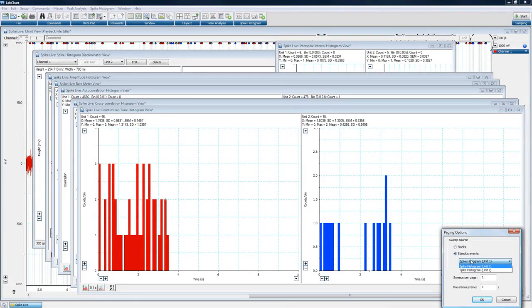So any data you can use in one of those features to define an event in general with peak analysis, any of the modules, with spike histogram as well as cycling measurements, you can use those stimulus events as the triggering information for the peristimulus time histogram. So very useful tool in terms of comparing these unit firings with other pieces of data.